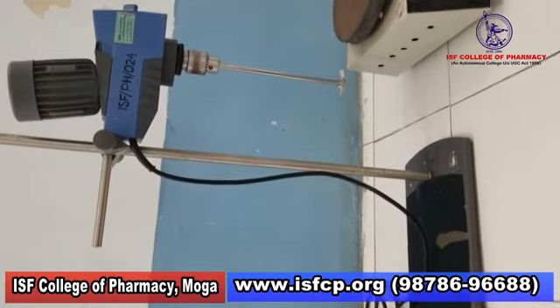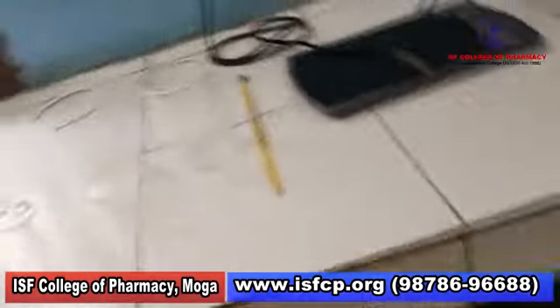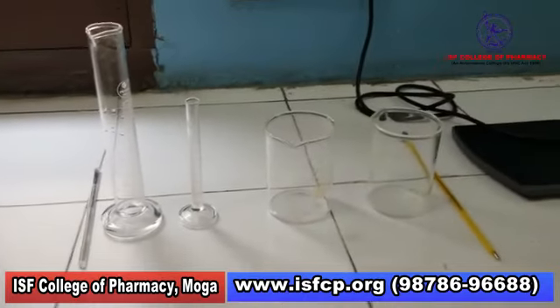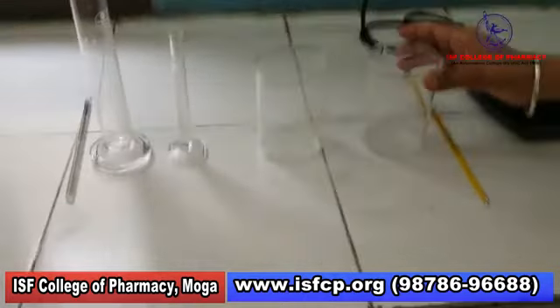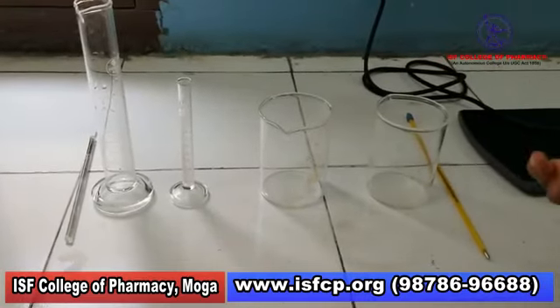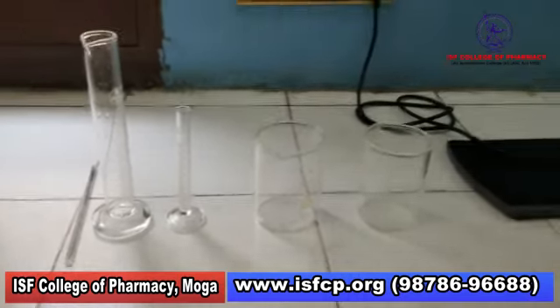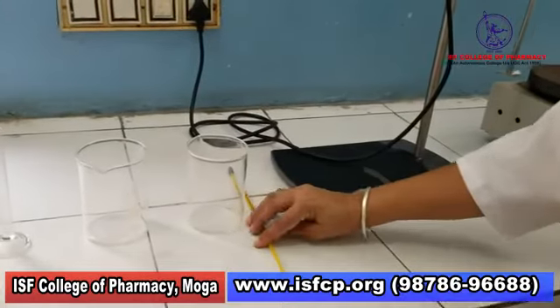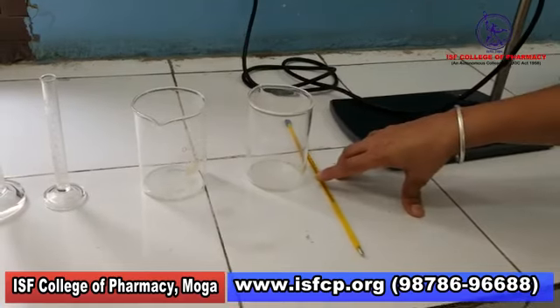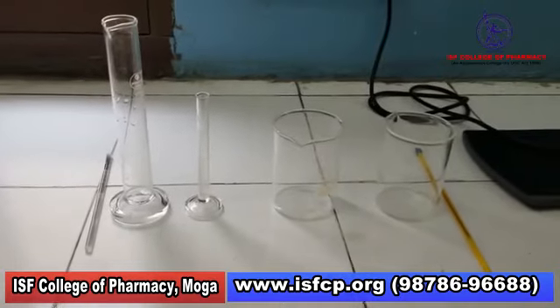For glassware, very simple glassware is required: one beaker for the aqueous phase, another beaker for the oily phase, a measuring cylinder, a glass rod, and very importantly, a thermometer for maintaining the temperature, and the weighing balance.